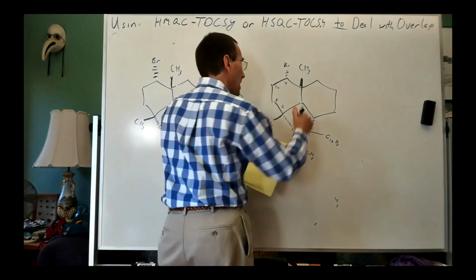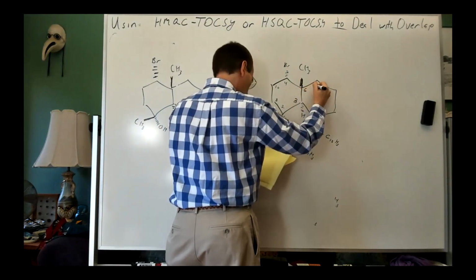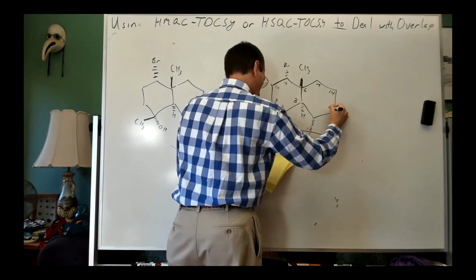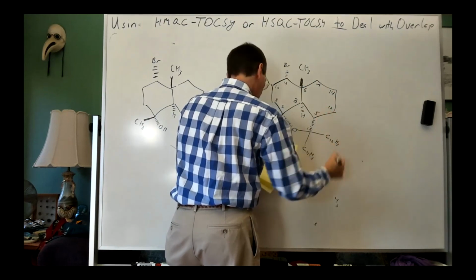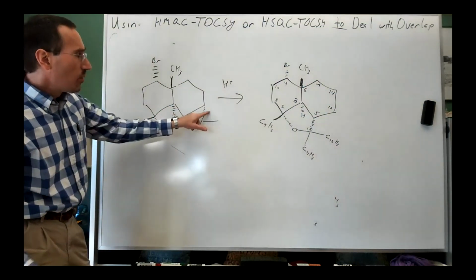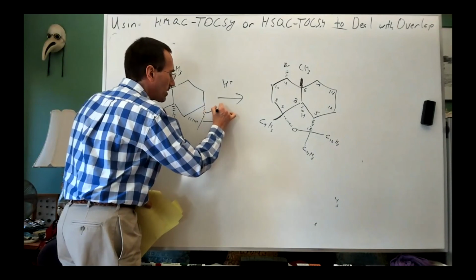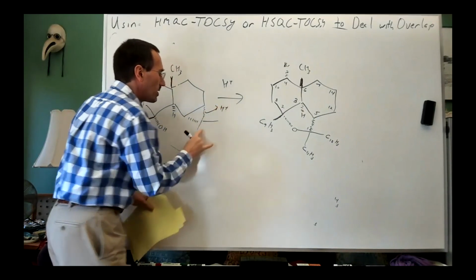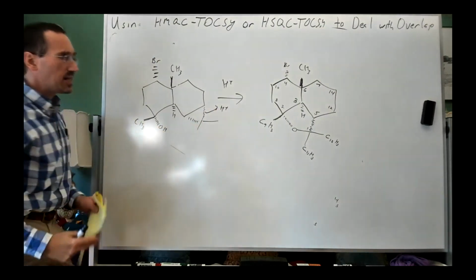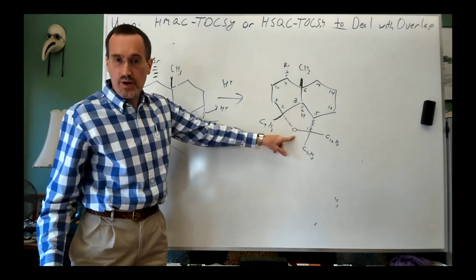We continued our assignments. Here's carbon number 3, carbon number 6, 7, 14, 12, and 5. So the skeleton has stayed the same. What's happened is we've ring protonated right over here, generated a carbocation here, our oxygen has attacked, and so now we have this tetrahydrofuran ring.